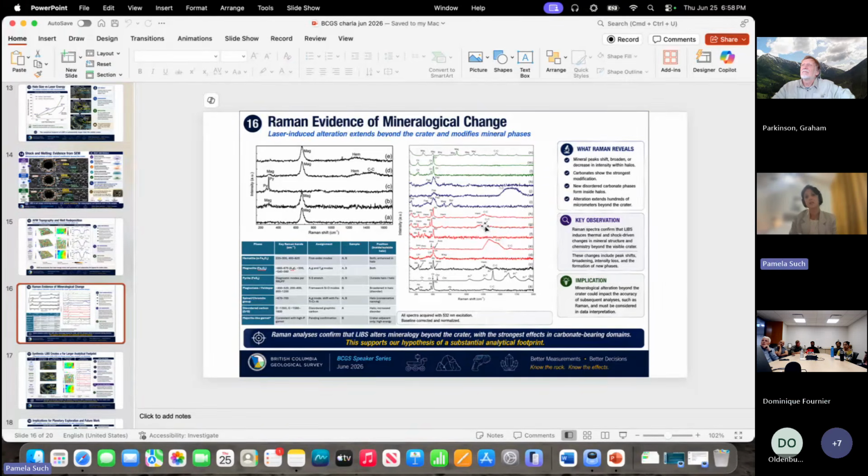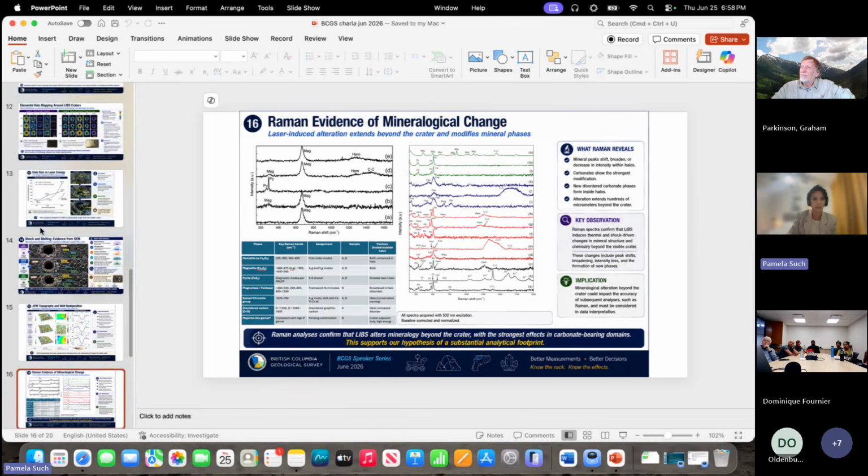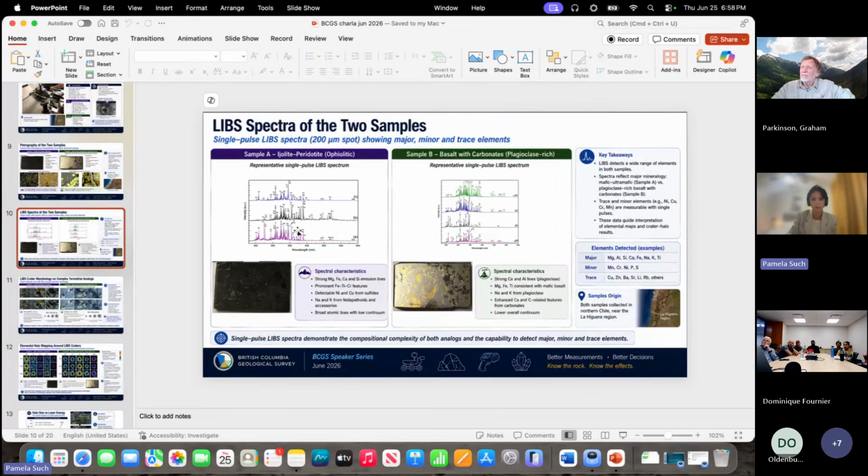Well, the instrument itself, the laser and the Raman, can quantify, but with AI today, they are generating software that, when you're mapping an area, for example using LIBS to map an area of a core sample, can quantify for you. But the instrument itself cannot quantify. It would just give you spectral information, like you are seeing here in the presentation. But software today is being built to quantify.